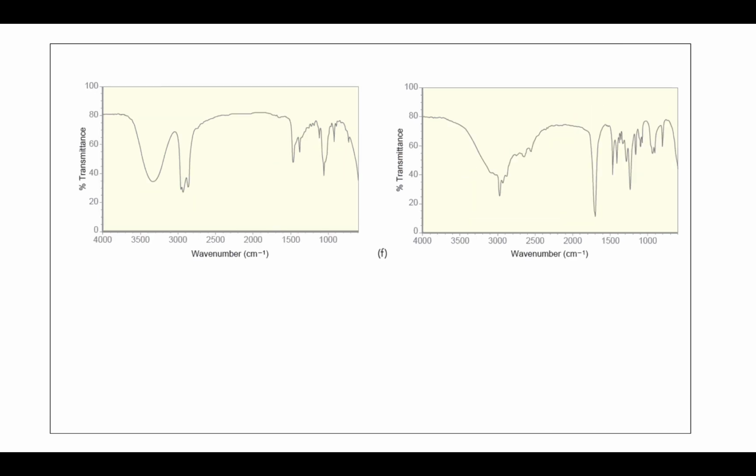Those two definitely correspond to an alcohol because of this peak here, and to an acid because of this broad peak, which is between those, in addition to this C double bond O group.